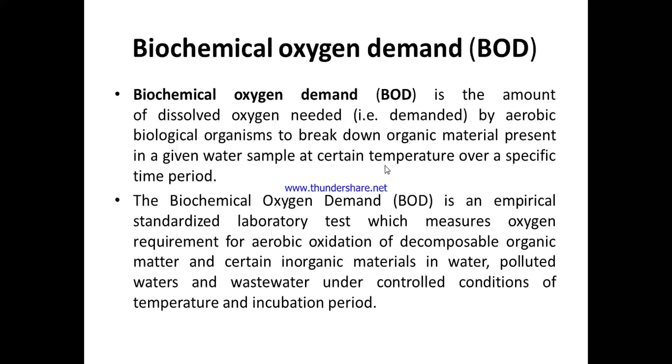Okay, the biochemical oxygen demand is an empirical standardized laboratory test which measures oxygen requirement for aerobic oxidation of decomposable organic matter. You know students, there is always organic matter present in the wastewater, even in a water sample, and it keeps on being oxidized or decomposed by the aerobic bacteria and other microorganisms that are present in the water, and in turn the dissolved oxygen level of the water or wastewater keeps on decreasing.